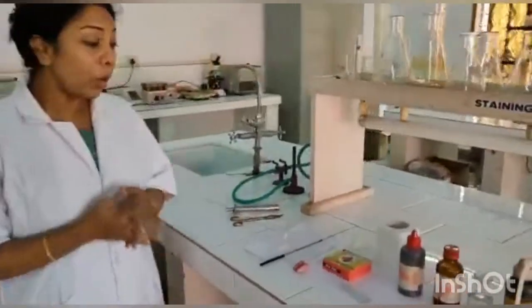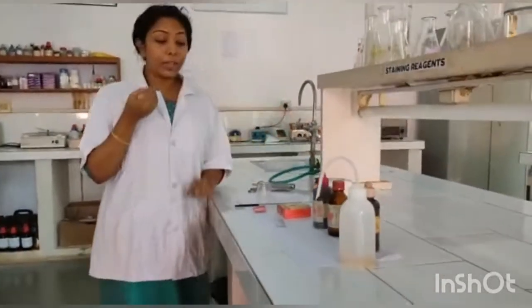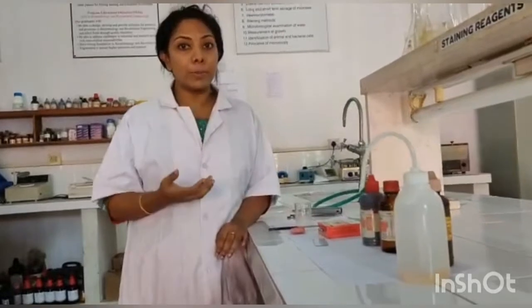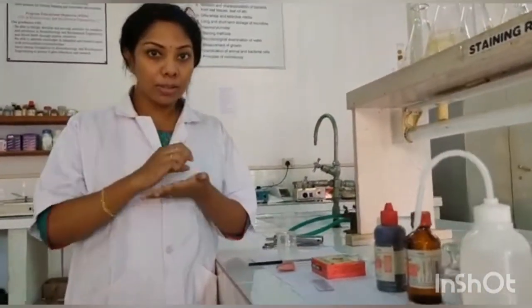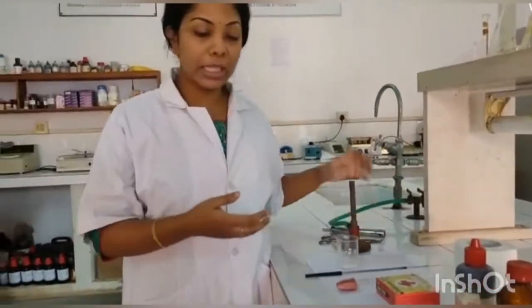You also need a lamp facility because we use a heat fixed smear. So we have to apply the bacterial culture smear on the slide and then heat fix it by using the lamp.